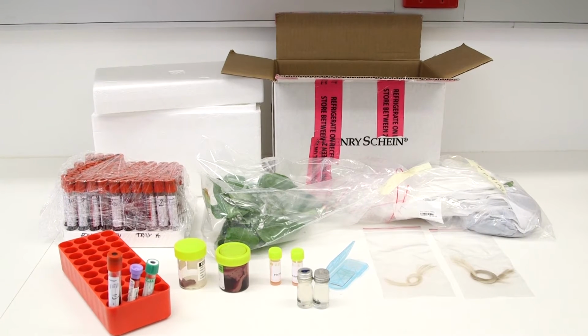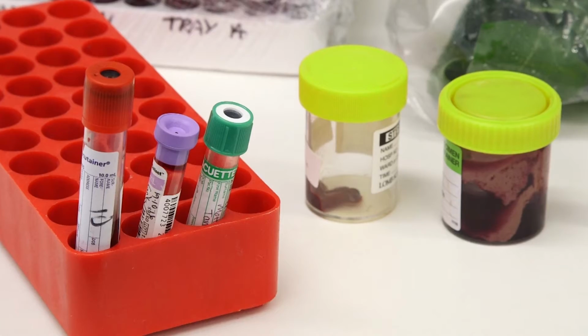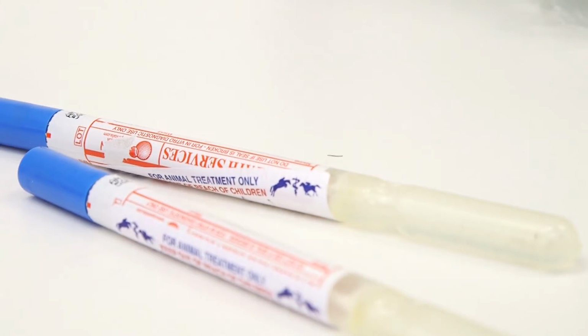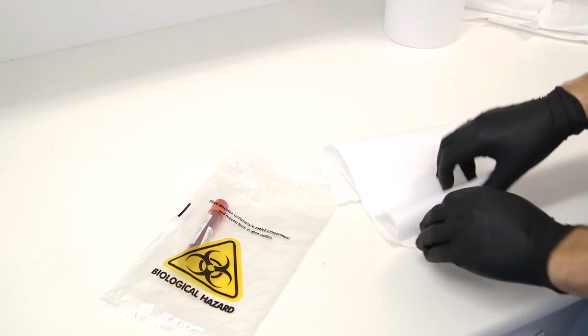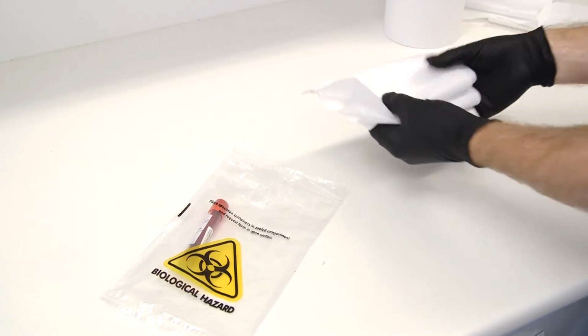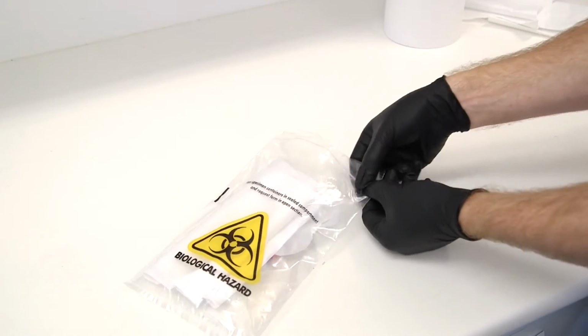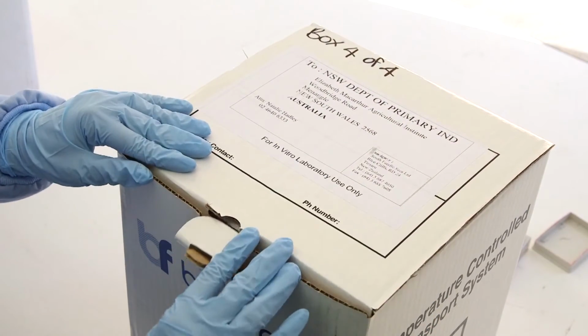As with general samples, all Category A specimens must be shipped using the triple packaging system. This means you need to use a primary receptacle, a tube, vial or other container typically made of glass or rigid plastic that's in direct contact with the specimen, a secondary packaging including cushioning and other materials that fully encapsulates the primary receptacle, and an outer packaging for shipping or transit.